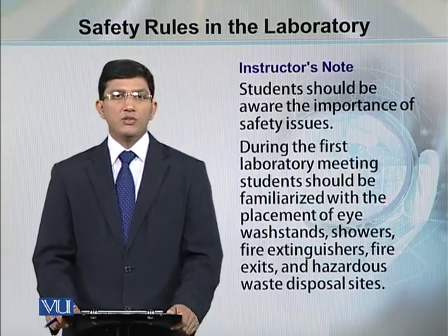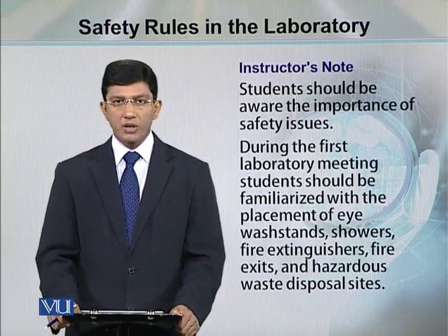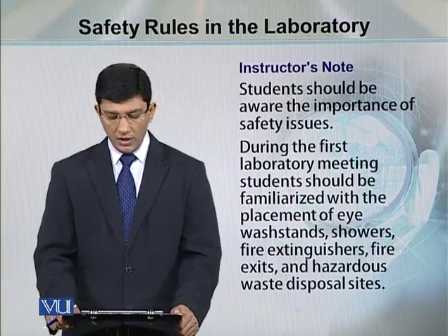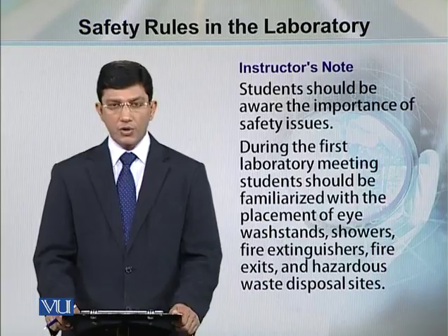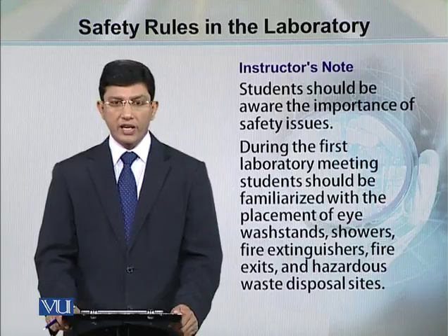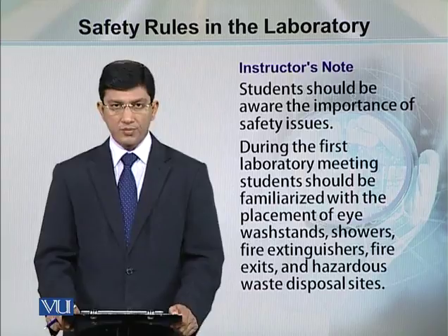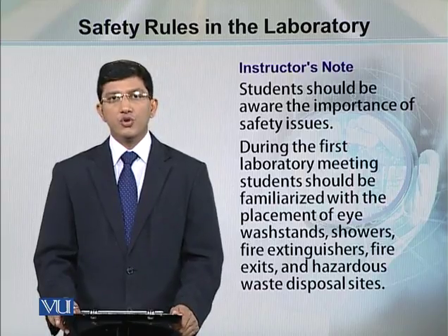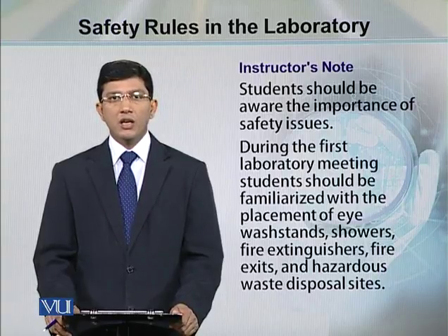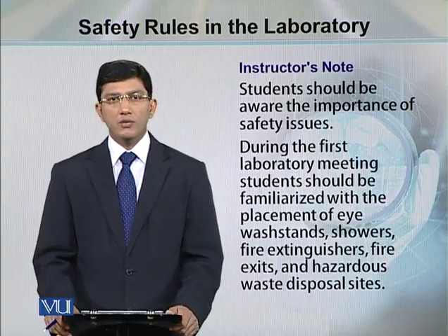Time should be spent with the students in the laboratory to show them the safety equipment, and to practice with the safety equipment like wash stands, showers, fire extinguishers, fire exits, or hazardous waste disposal sites. All these things should be given proper time so that students know in case of emergency how to handle it, where to go, and how to escape the building.